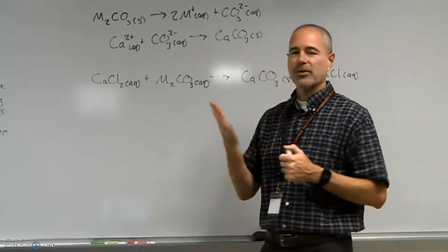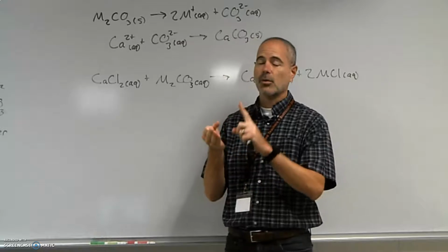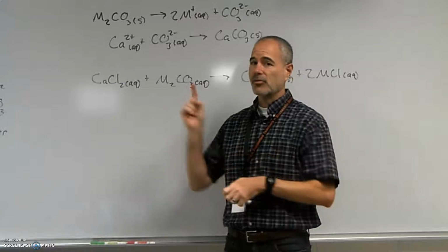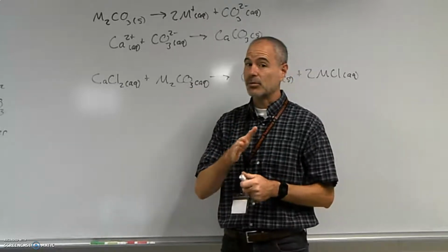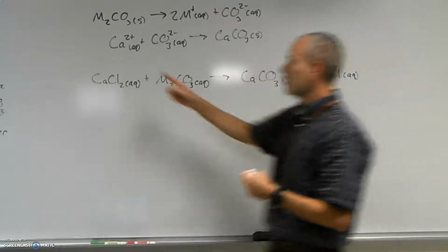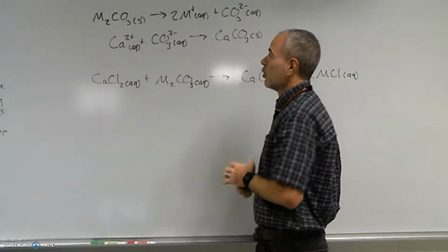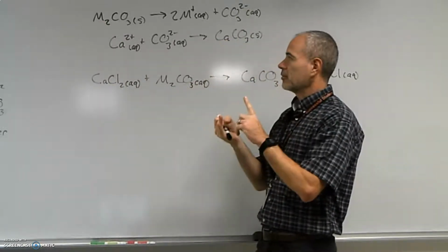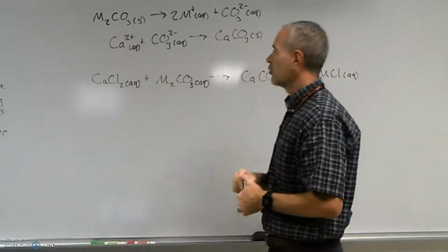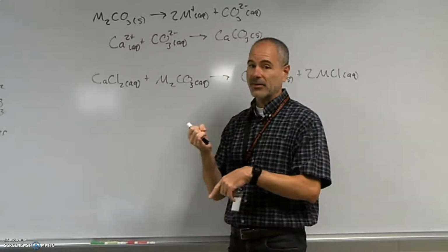And the ones we're mostly going to be thinking about for that would be lithium, potassium, or sodium. You've got cesium and rubidium in that group too, but we're not going to worry about those. Remember that hydrogen is not considered a group 1, even though it's in that column. So our characters could be, M is not a metal or an element, it's just the metal we're trying to figure out. We are trying to figure out, is it potassium, lithium, or sodium in this mysterious position? So ultimately, we want to figure out what the identity is by figuring out what the molar mass is.